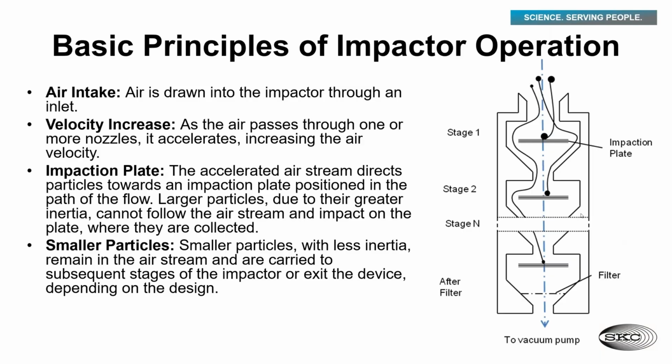And so to kind of review, as air comes into the impactor, it's accelerated, similar to a cyclone, but rather than using a spinning motion to spin out the larger particles with their inertia, it's using these tight corners, kind of like our body is. As we breathe in, there's a lot of tight turns that are removing those larger size particles while allowing the smaller particle to stay suspended in the airstream. And that's due to its smaller inertia and the ability to just stay in the air.